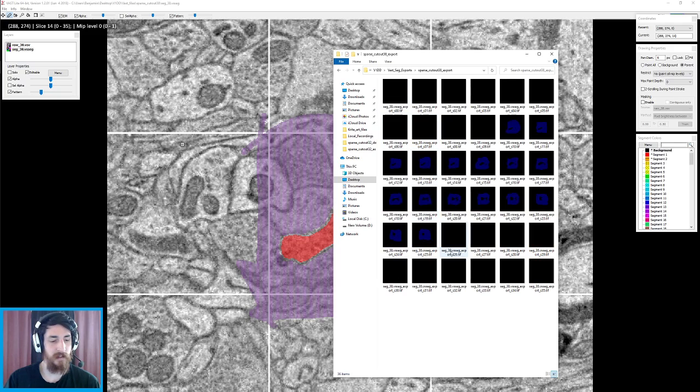And it did. We're going to Control A, and we're going to drag and drop into Google Drive to the folder that we just created. And once it's finished uploading, that will be the end of that Sparse cutout 38 dataset. Correctamundo, fixed it up, all good, ready to be injected into the formula so that we can get the AI better at detecting parallel boundaries, which is what we want to happen.